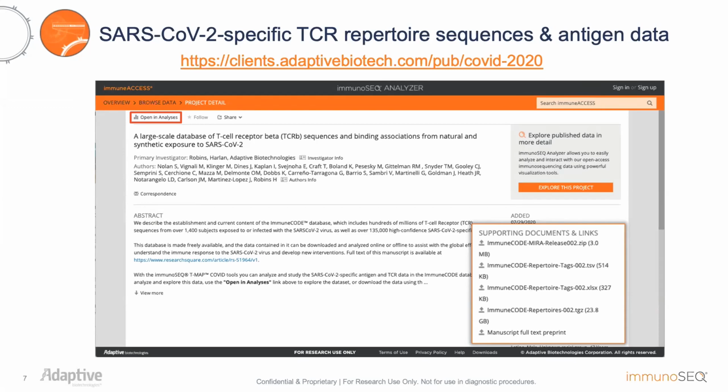However you access this data, you will be able to open the data in the analyzer by using that Open in Analysis link highlighted in the red box. This will open all of the repertoire information and allow you to work with it directly in our software.